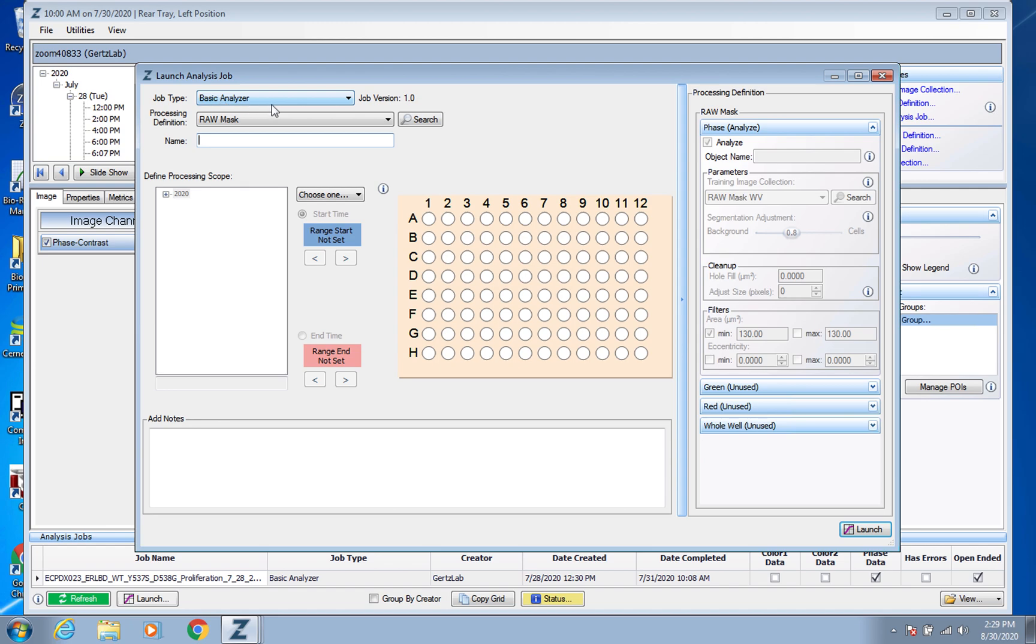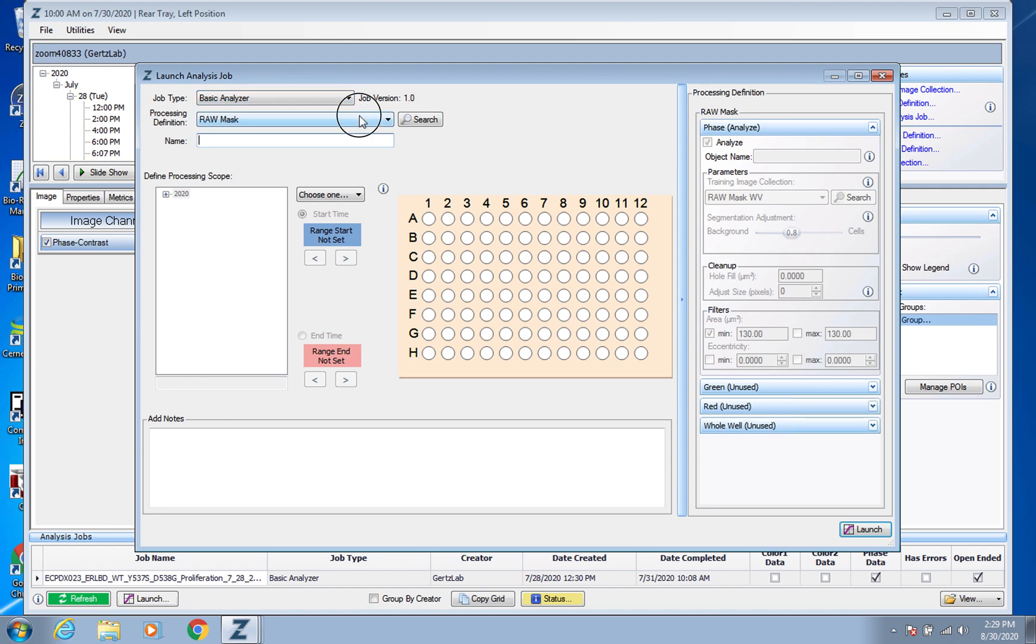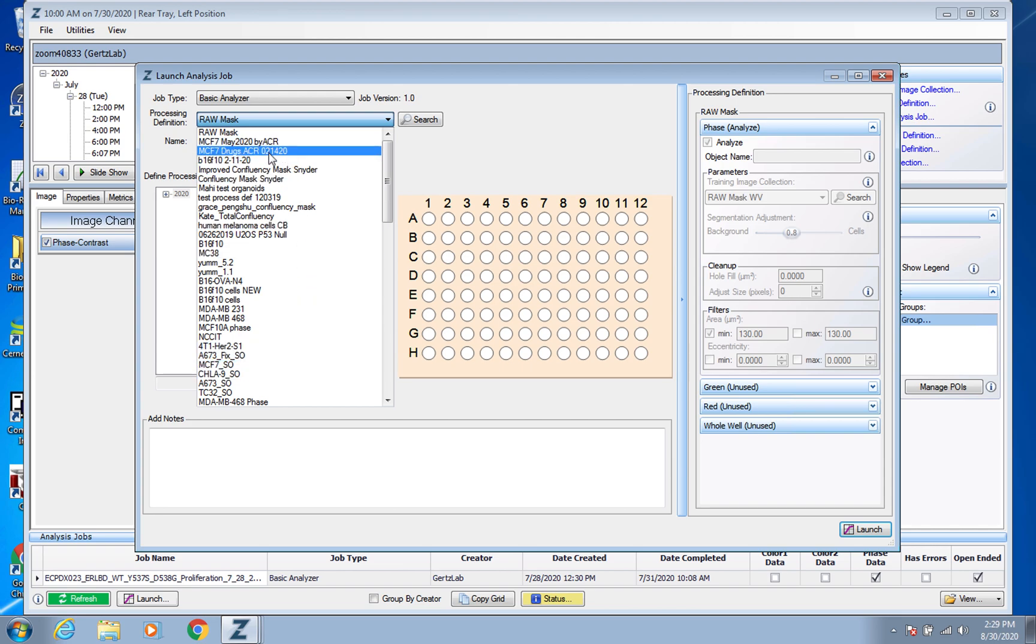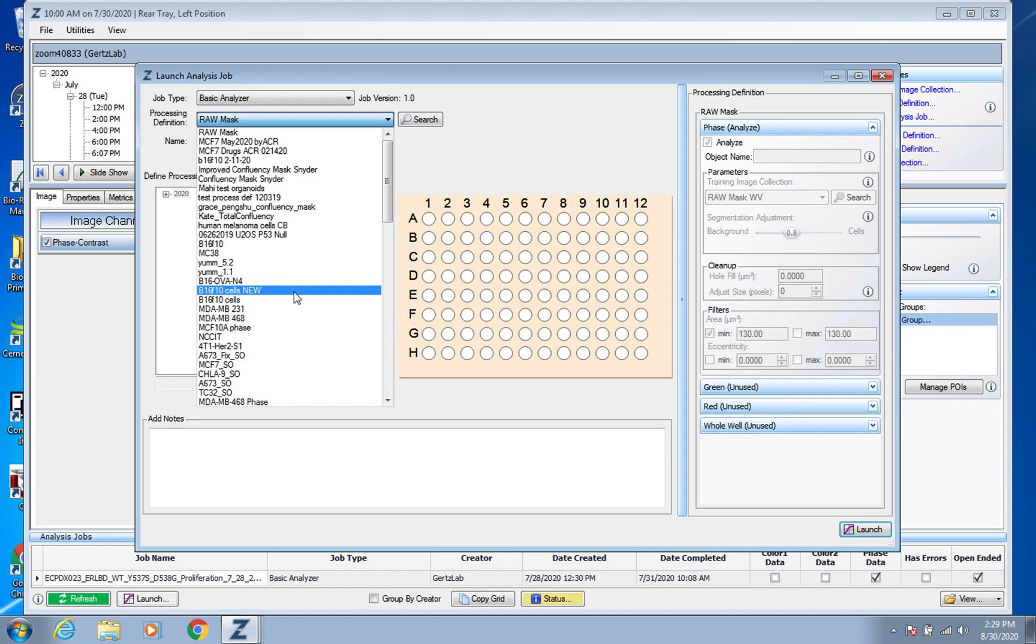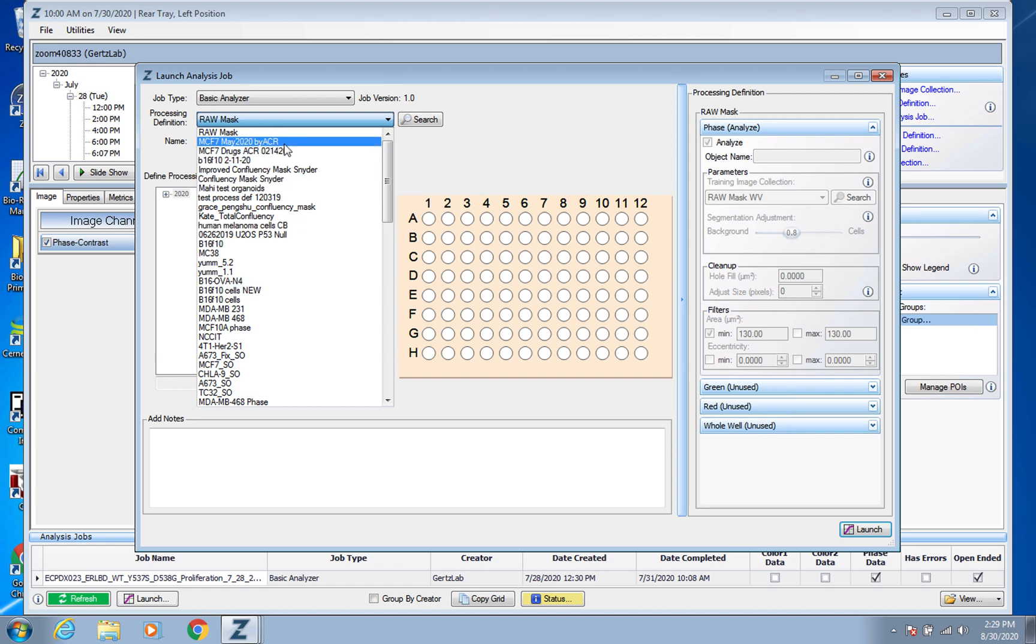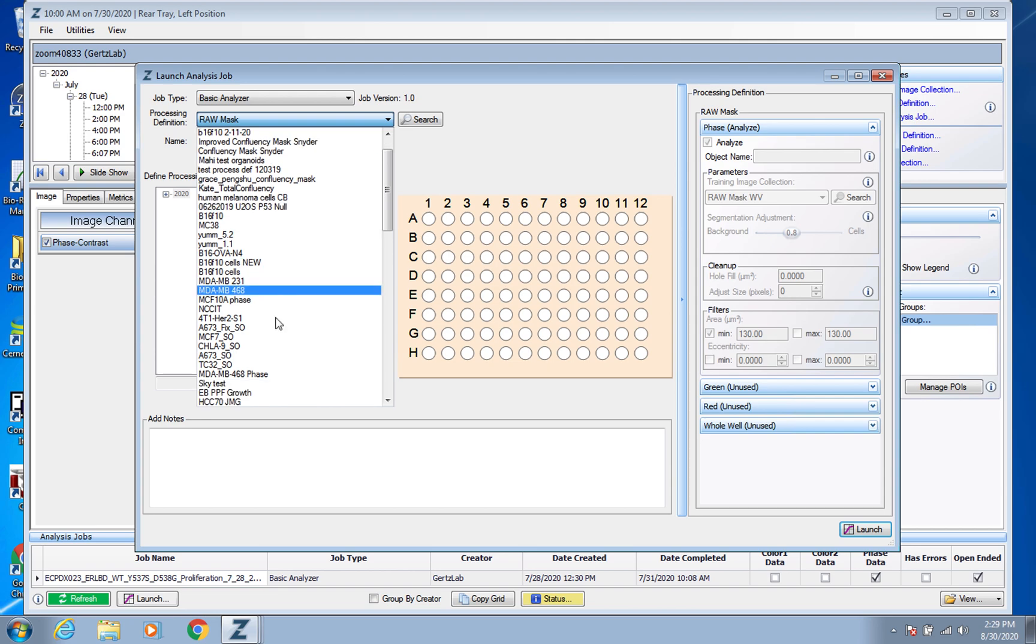And because this is a proliferation plate, it's going to give you basic analyzer analysis jobs to pick from and you would just find the one that makes sense. You can see there's a lot on here because this is a shared device and so it has ones from a bunch of different labs.